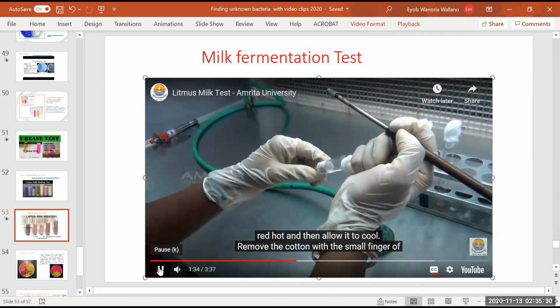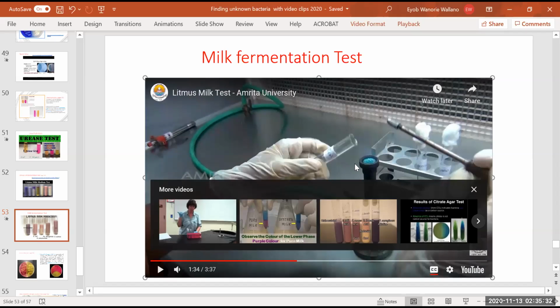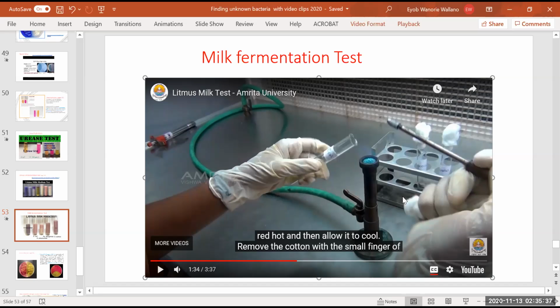Do you see that? This one is very interesting. This is wrong advice which the laboratorian is giving. In the laboratory, if you are right-handed, yes, you use the loop in your right hand. But it says right hand here; no, it's not like that. If you are left-handed, you hold the loop in your left hand. So it makes it different.